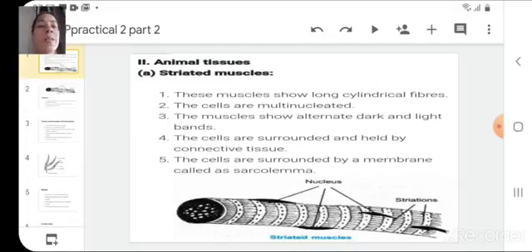In this slide, you can see a structure is shown there. And if you focus more on the structure, you will come to know that a certain kind of pattern is present on the structure. What is this pattern actually? You can see some dotted lines, then some horizontal parallel lines, then again dotted lines, then again parallel lines. This is a form of band.